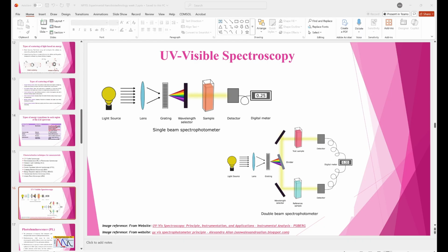For photoluminescence spectroscopy, here you can see you have an absorbance maxima, you have a fluorescence, and then you have phosphorescence, and you can see the wavelength is different for each. So absorbance is your excitation. There is a thing which is said, you can use UV visible to find out the excitation maxima. So if you have a fluorophore, you can perform a UV visible spectroscopy. The absorbance of the fluorophore is the excitation wavelength of your fluorophore. Okay, so absorption maxima and excitation maxima is basically the same.